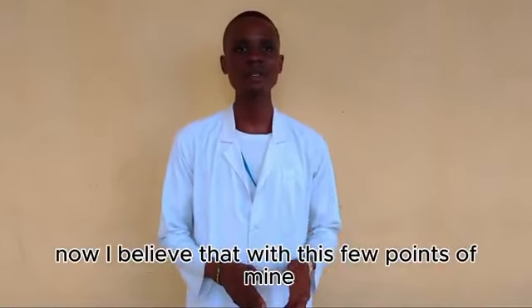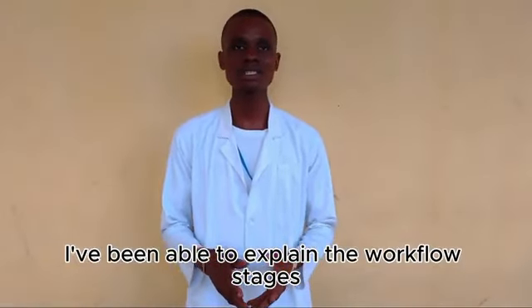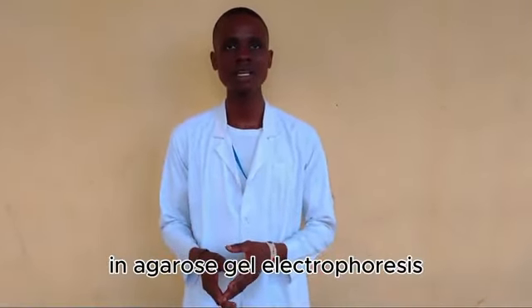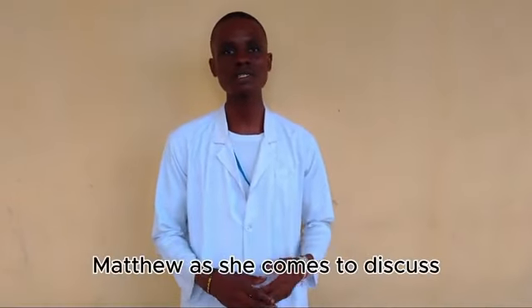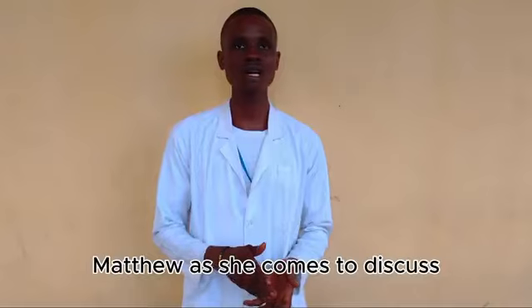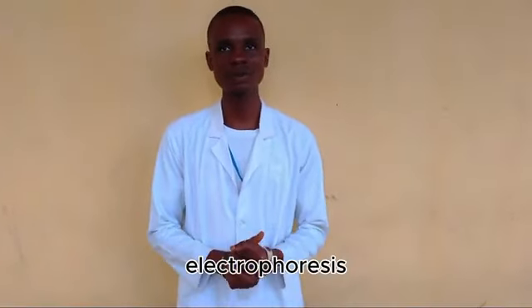Now, I believe that with these few points of mine, I've been able to explain the workflow stages in agarose gel electrophoresis. And now I will call on my fellow teammate by name, Hope Matthew, as she comes to discuss another topic that is applicable in agarose gel electrophoresis.